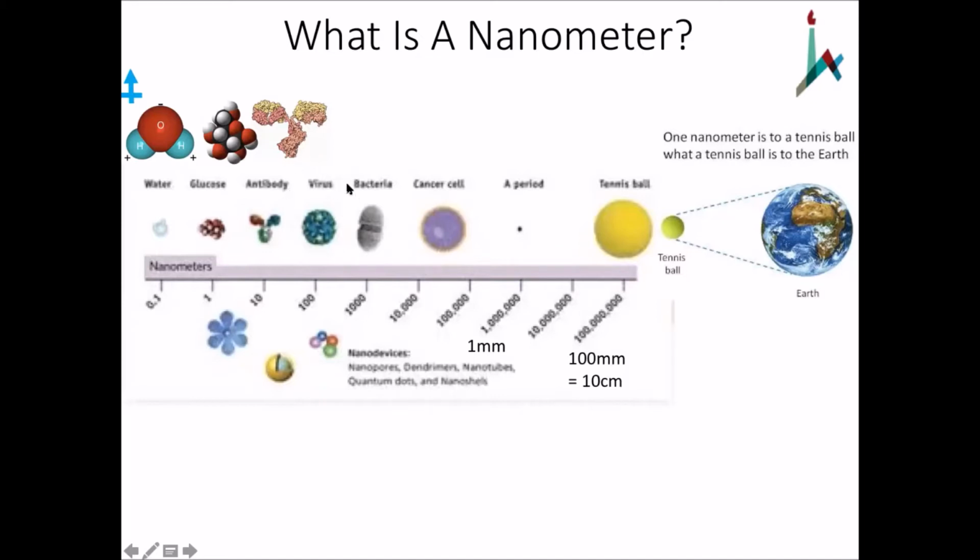That doesn't mean that you can't see a fluorescent dot that is a virus because someone added some molecule to make it fluorescent, okay? But the bottom line is that if you want to resolve a virus, that means see its structure, you cannot do it in an optical microscope. A bacterium, which is 1 micron or 1,000 nanometers, you certainly can see in an optical microscope, and you'll see why in a moment.